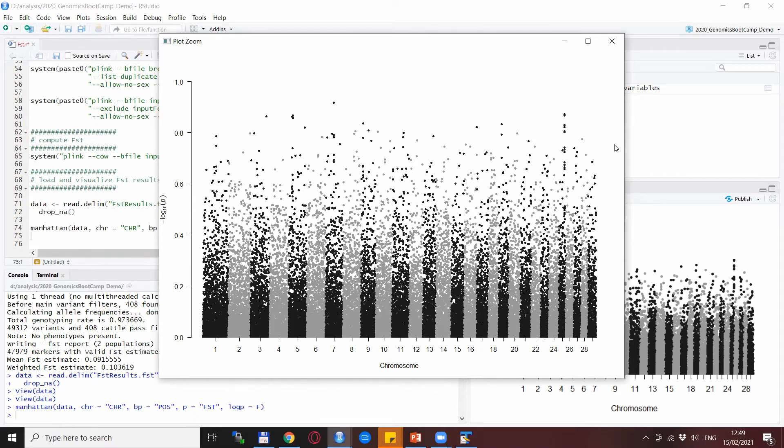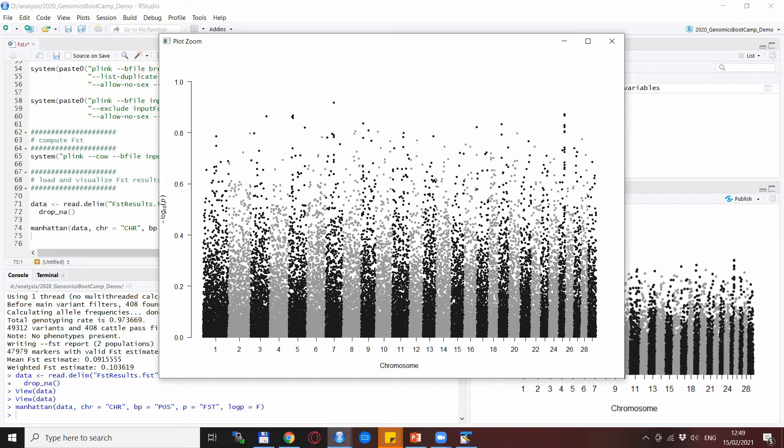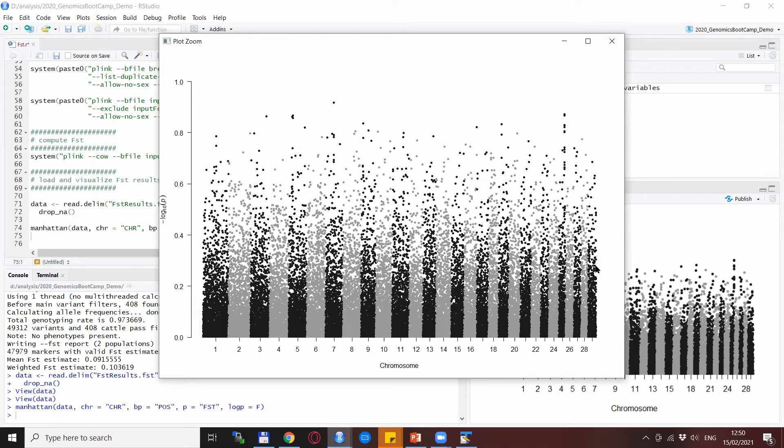What we will not do in this video is follow up further on—for example, this seems to be a quite interesting signal, and probably there are some interesting genes in the region—but for now we will cut it here and basically just provide the tool for getting an FST analysis done with Plink.